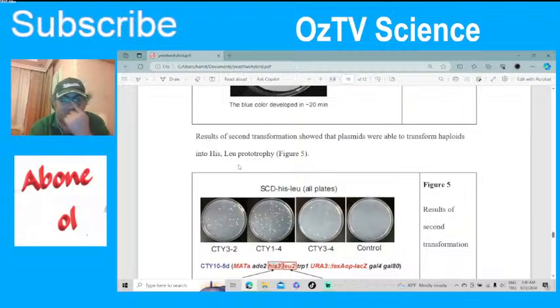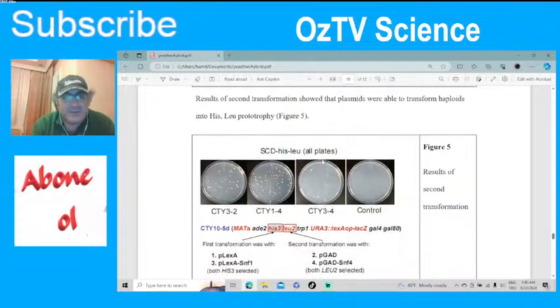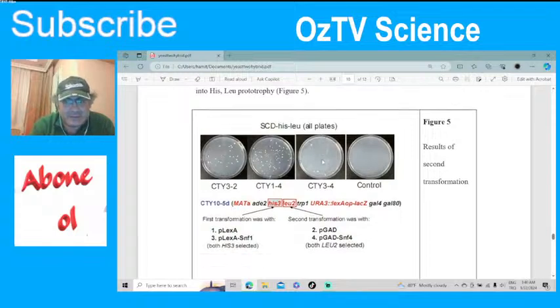So it's important, when working with yeast, when they mate, you have to make another synthetic complete media to prepare for the required prototrophy. So they complement each other.